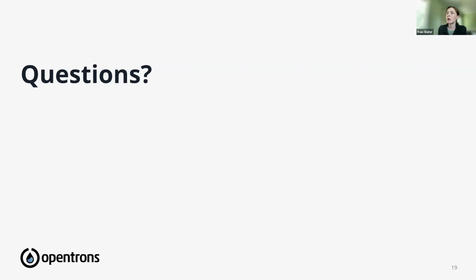So one more, no, sorry, two more. If you need to generate a protocol from a microscope, do we need to contact the manufacturer, or does knowing the software, will that be enough to generate an AI protocol? And then there's a follow-up question. I saw you had a protocol in Python. Is this the most preferred way to generate the protocol, or are there additional ways?